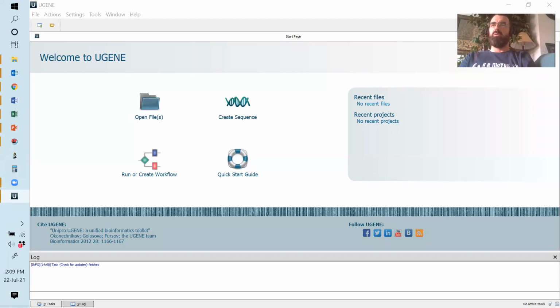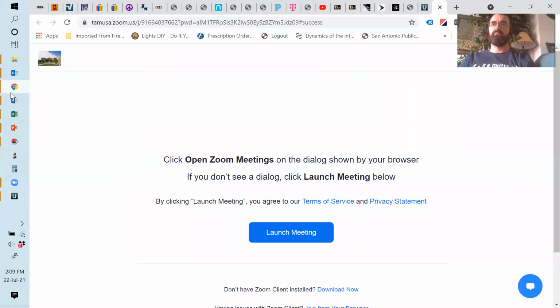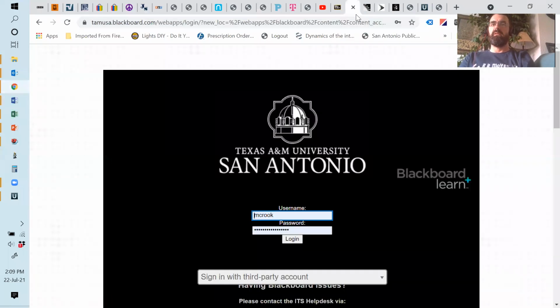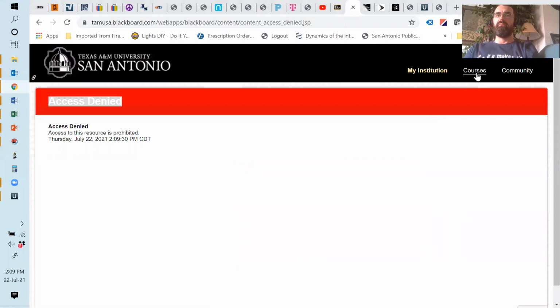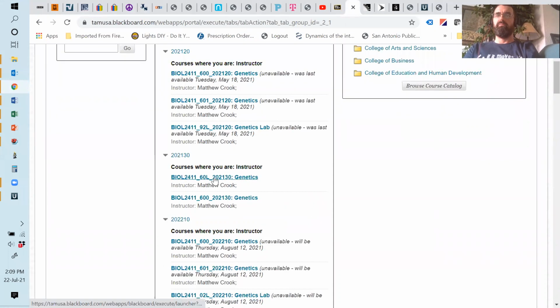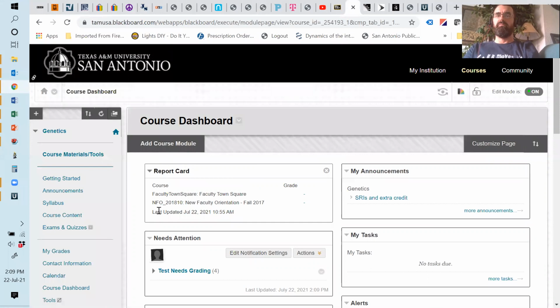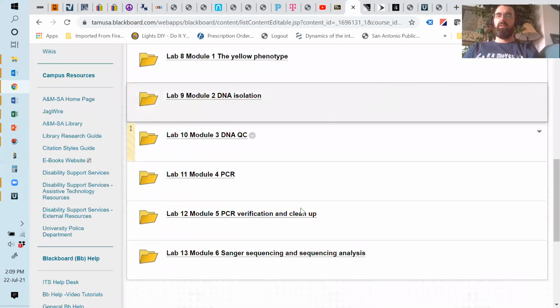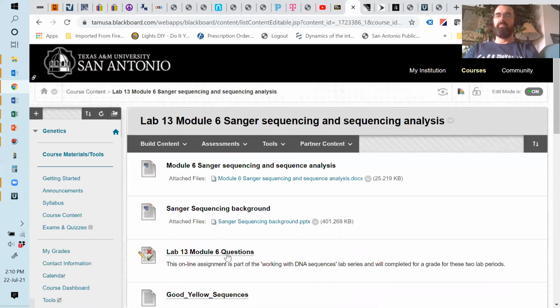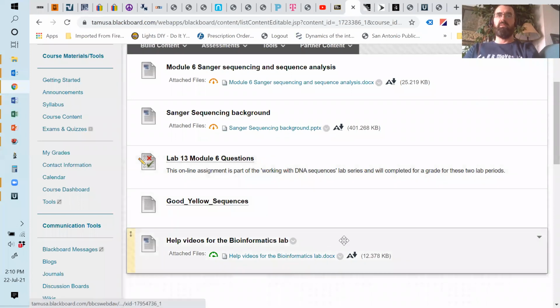Okay, give people a moment to do so. Is it starting up okay for you, Adam? Cool. Yeah, this isn't necessarily a particularly user-friendly piece of software. Actually, you know what would be useful?